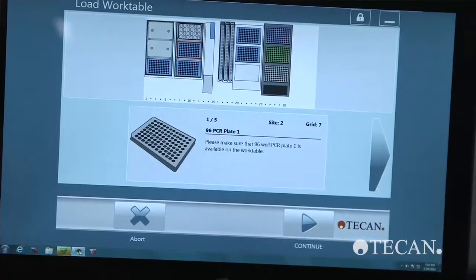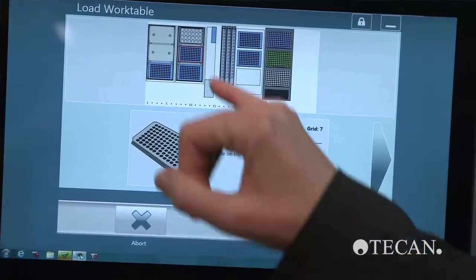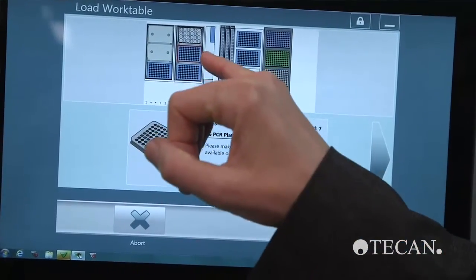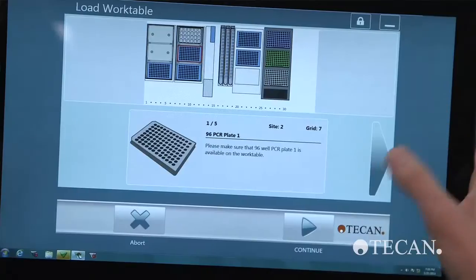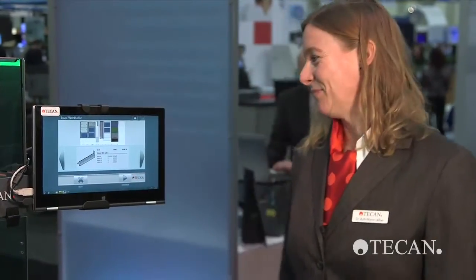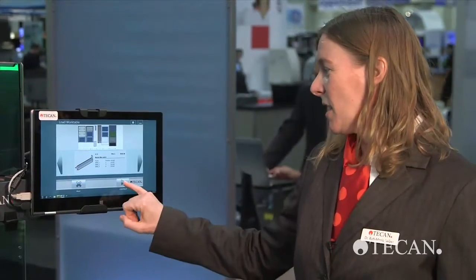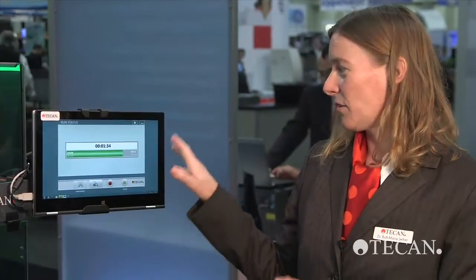And here, every single item is visually displayed where to put it on the work table, and also with the exact volumes required for the run. So once you have finished setting up your work table, you can already continue and start a run.